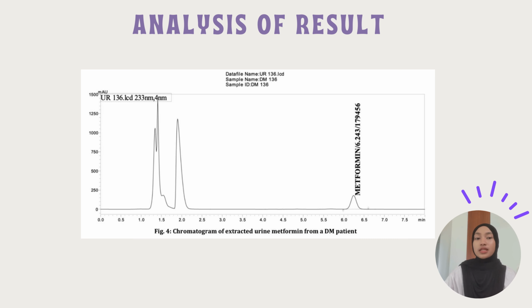For the baseline stability, the baseline before and after the metformin peak is stable and flat, demonstrating minimal noise and interference from other compounds present in the urine sample. This stability is crucial for accurate quantification and reliable detection of the analyte.